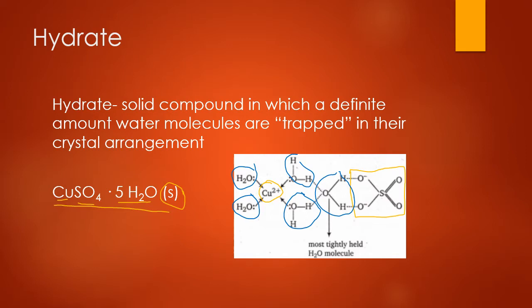Since these electrostatic forces are weaker, what we're going to do in the lab today is drive off those water molecules. We're going to try to make the hydrated compound an anhydrous compound, anhydrous meaning with no water, dry. So our goal is to get these water molecules out of the crystal structure.